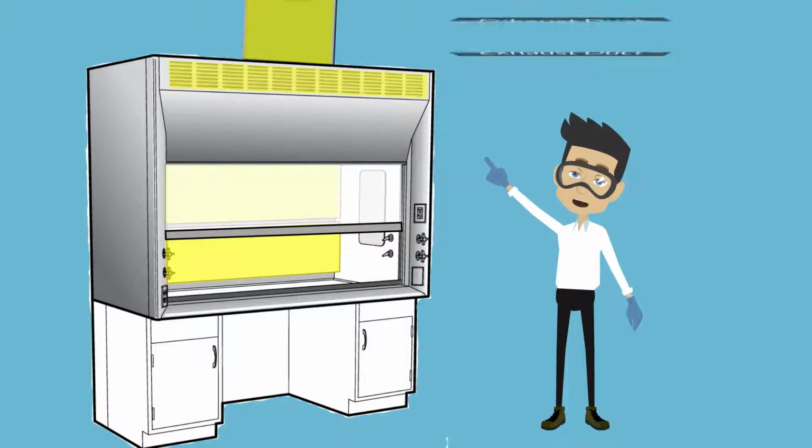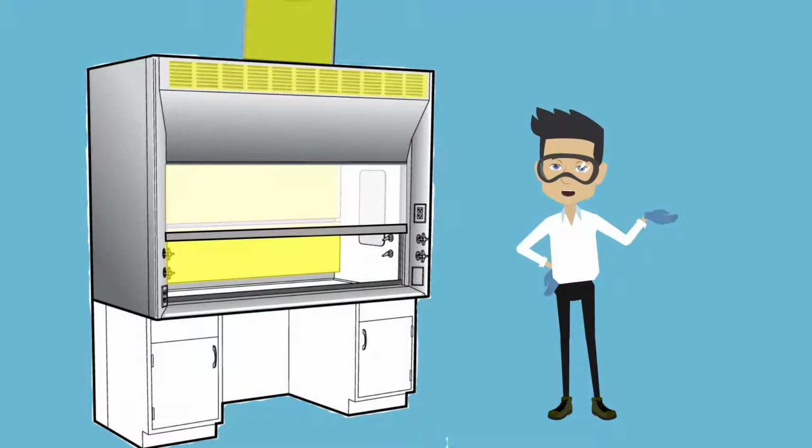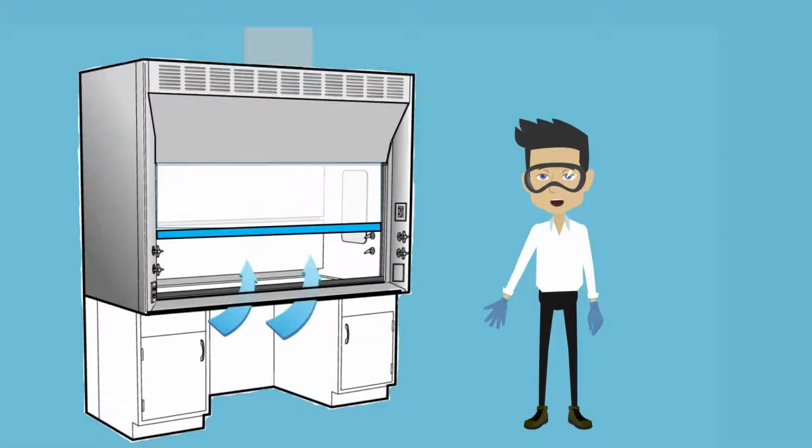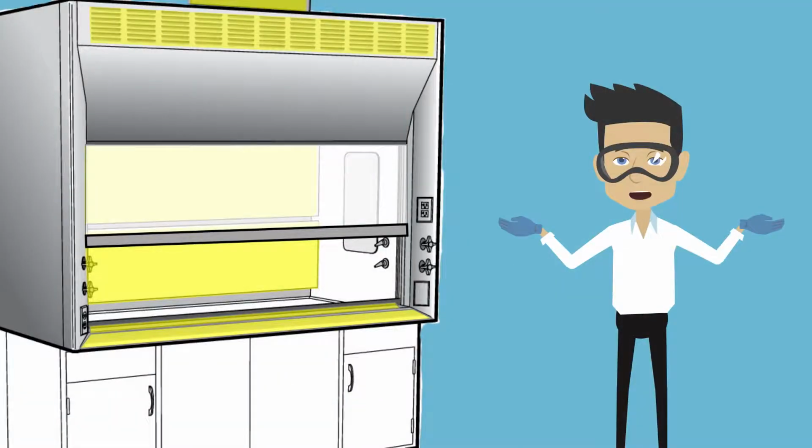Fume hoods are typically connected, via ductwork, to an exhaust fan, usually located on the roof of the building where the hood is located. The exhaust fan draws air from the room where the hood is located, in through the hood opening, and out through the ductwork. The airfoil or sill, located at the front of the hood beneath the sash, creates a smooth airflow, minimizing turbulence of the air entering the hood. Now that we've discussed the key parts of a fume hood, let's talk about how to use it safely.